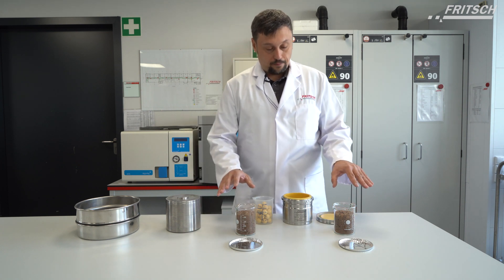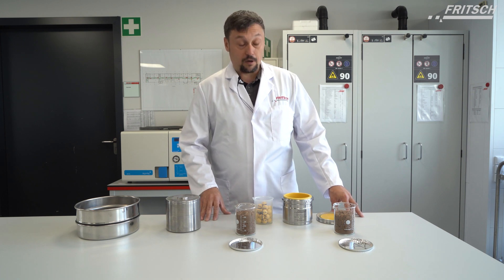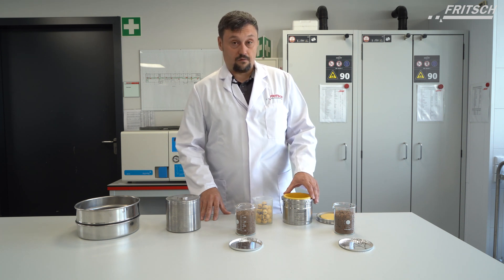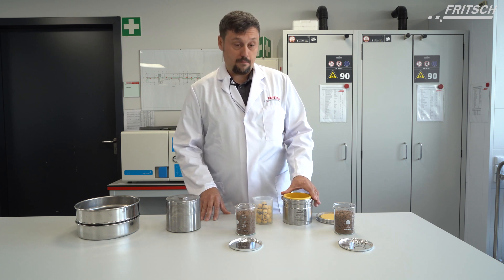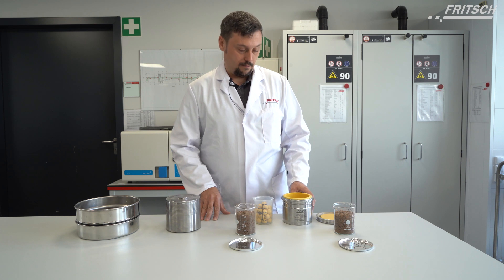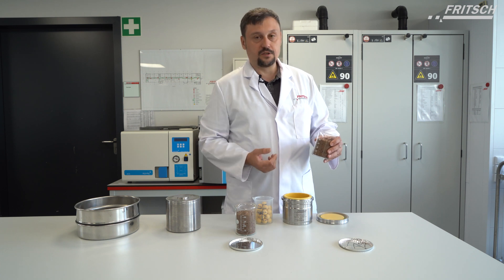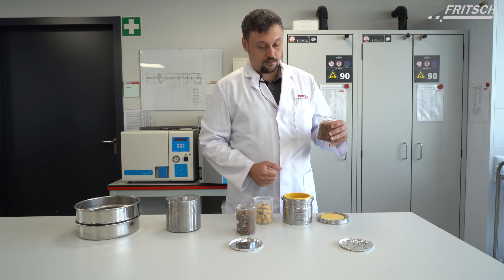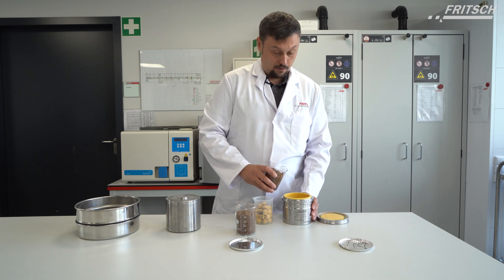We have two soil samples and we want to treat them using a planetary ball mill system for two tries. The first try is without the balls, just low rpm for a longer time. Then we want to grind with balls for a short period of time with higher rpm. For the first test we prepare sample A — approximately 250ml — without balls, filled into our zirconium oxide bowl of 500ml.